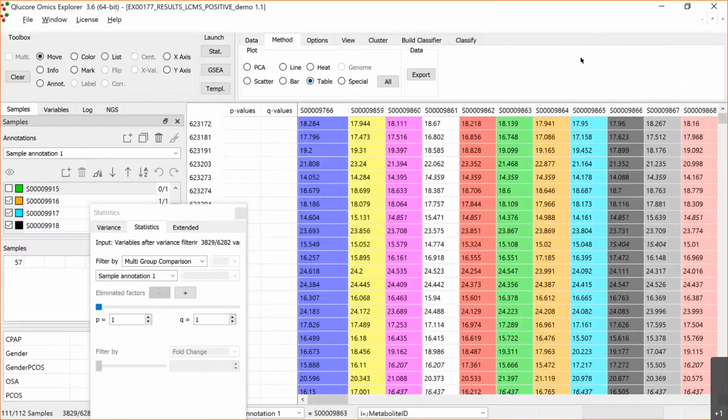I got a question, what does a missing value mean? A missing value is an empty cell in your data set, a value that has not been measured. So you don't know anything about that value. And then we need a value in that cell, so we reconstruct it.